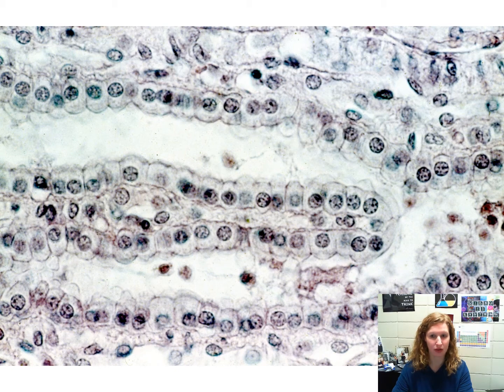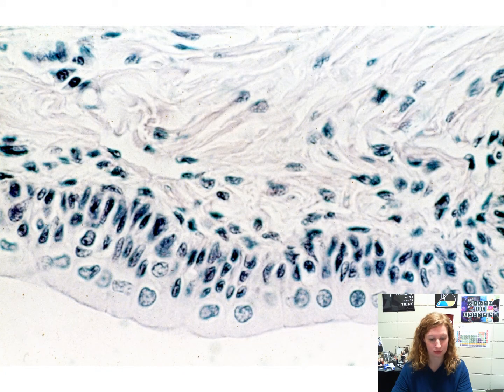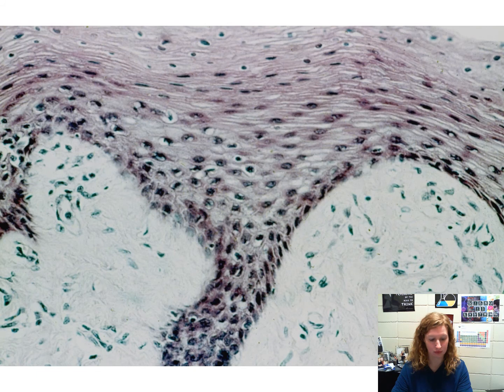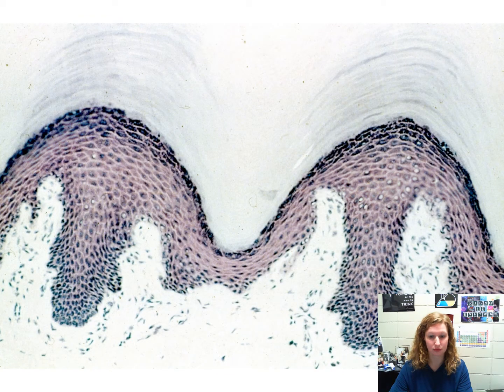Simple cuboidal epithelium, transitional epithelium, stratified squamous epithelium.